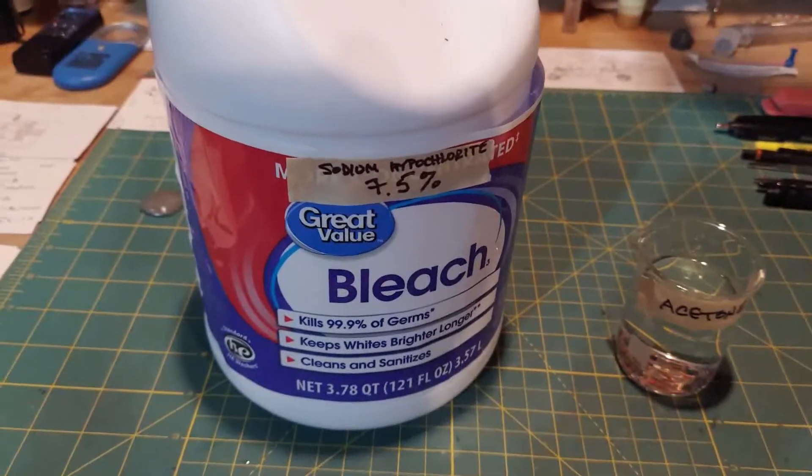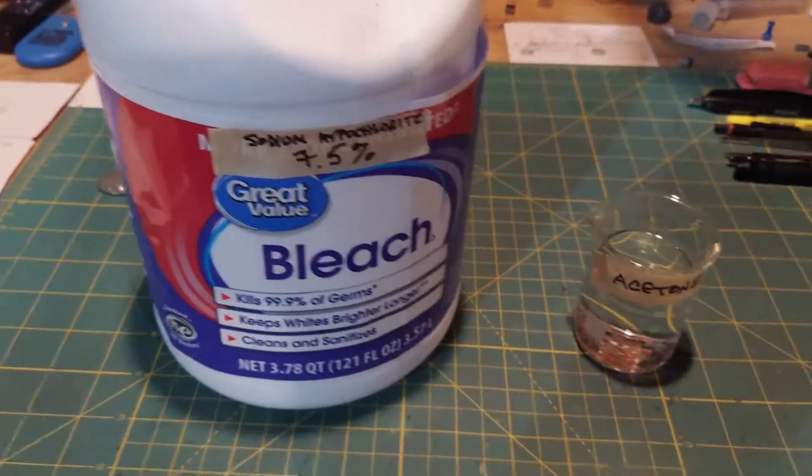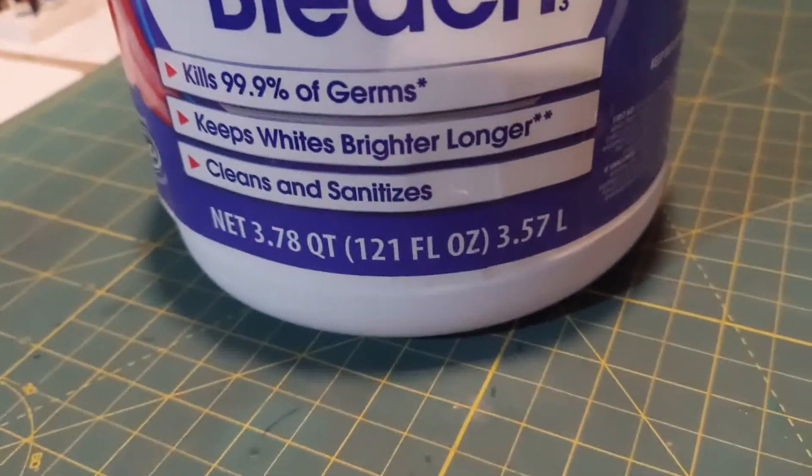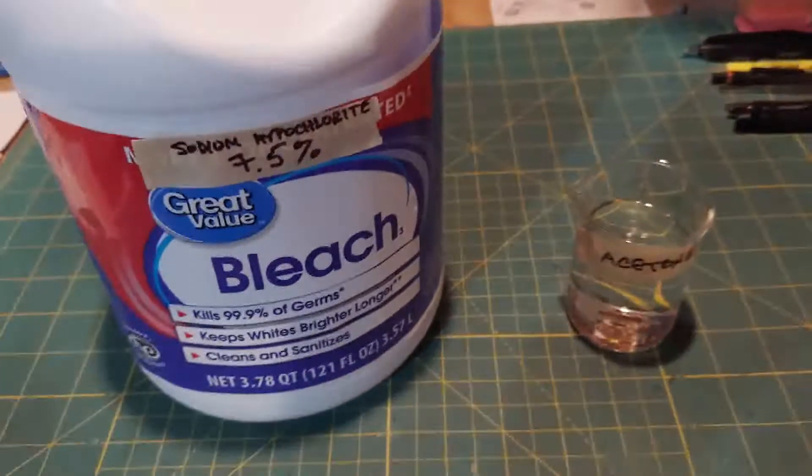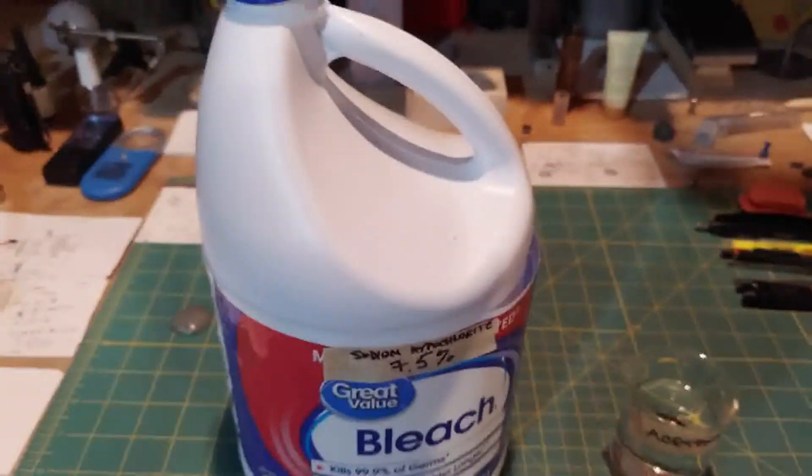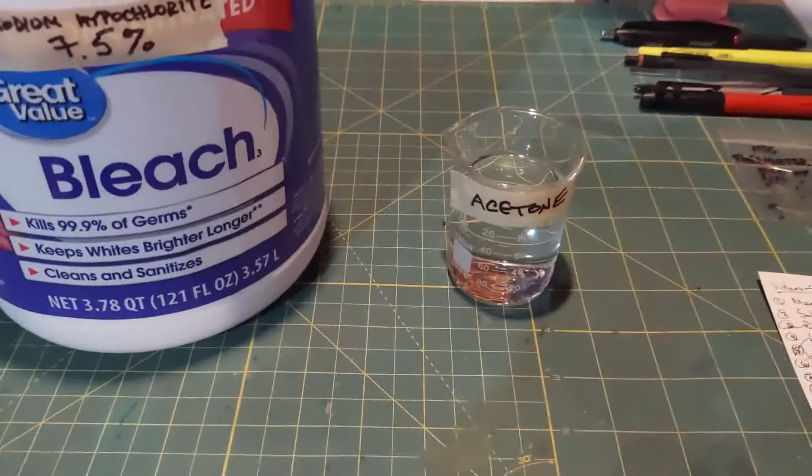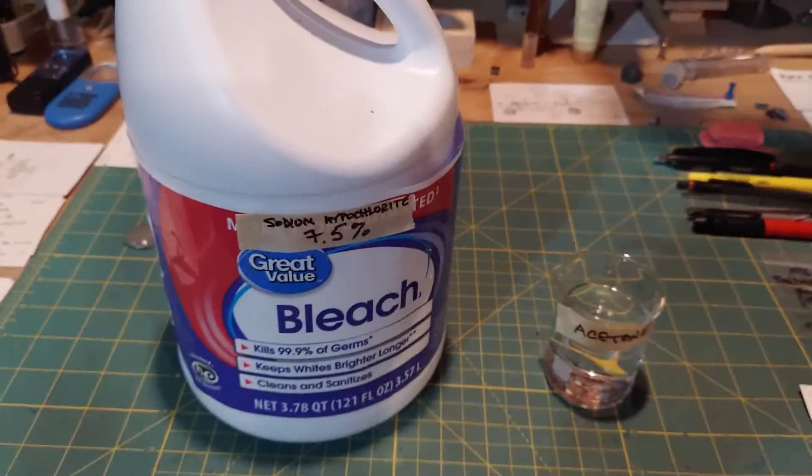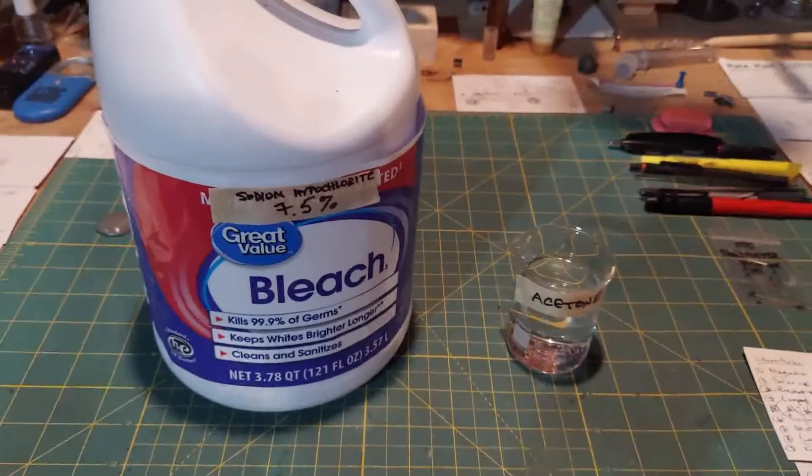This bleach is 7.5% and that matters. As far as the acetone goes, you can see here it's 3.57 or 3.6 liters. So this is the right ratio - it's a lot of bleach and only a little acetone. But the way these two react, that's what you need to do in order to end up with the best byproduct of chloroform in the end.